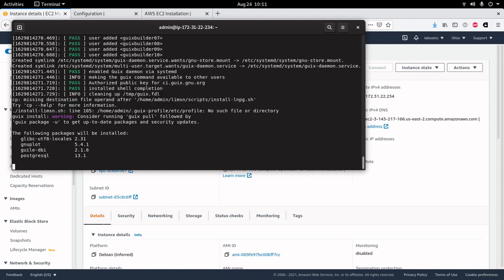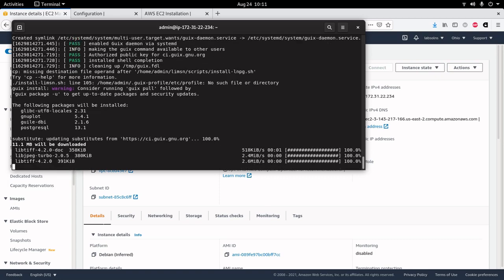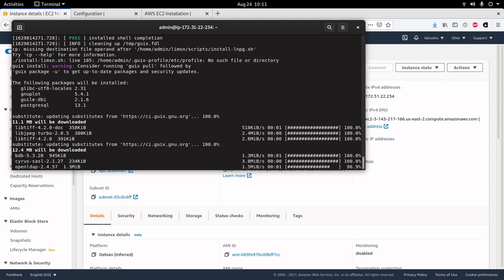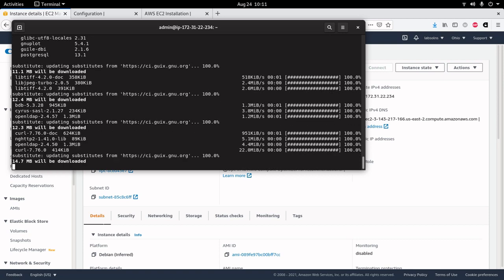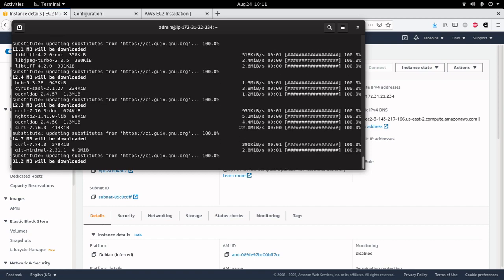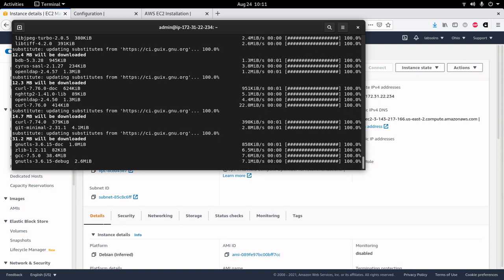The value of 100 plates per plate set that we entered will be used to modify the configuration file. However, it will be ignored by LIMS Nucleus until you register your copy. Registration is free. There is a hyperlink on labsolutions.com that will allow you to register. All you need is a valid email address. An unregistered copy will utilize the default 10 plates per plate set.